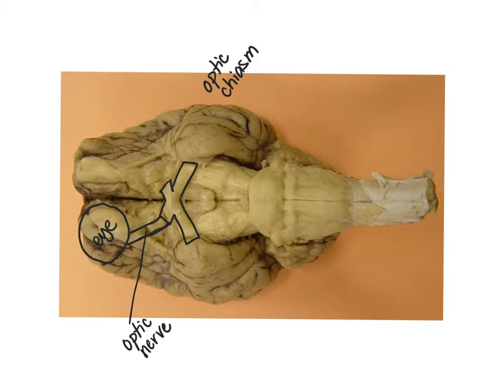The information from the two eyeballs, so from the left and the right, then crisscrosses here, and information from both eyeballs then goes through these optic tracts here. So the optic tracts are after the optic chiasm, which is technically the middle, or where this crisscross is happening. So I use the optic chiasm as kind of a landmark in order to help me find other structures.